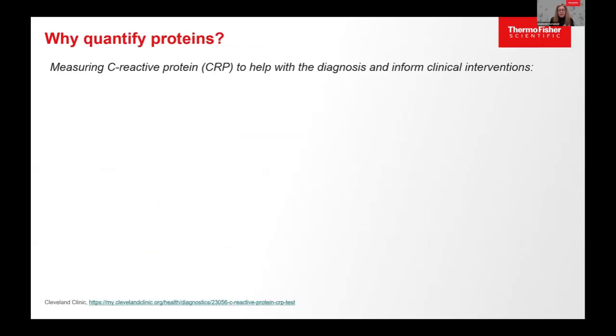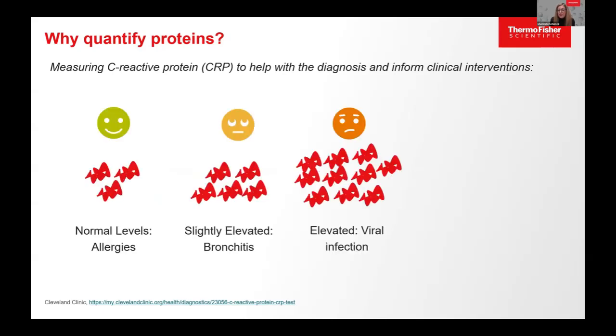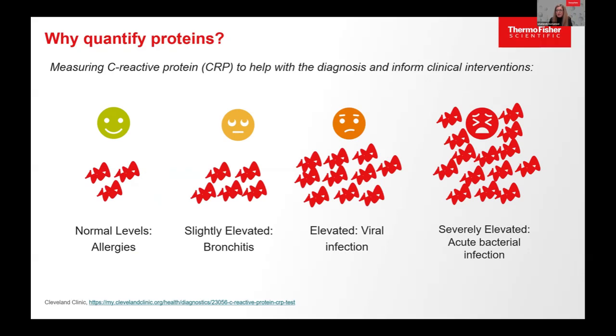That explains the biology. For example, sometimes we do lots of discovery and lose sight of how important protein quantification is. I have an example of CRP, which most of you have identified from plasma because it's one of the high abundant proteins. But actually measuring CRP in the plasma of a patient going to a clinic with just congestion could explain what type of symptom or disease they have, at any stage, or any different kind of viral or bacterial infection.